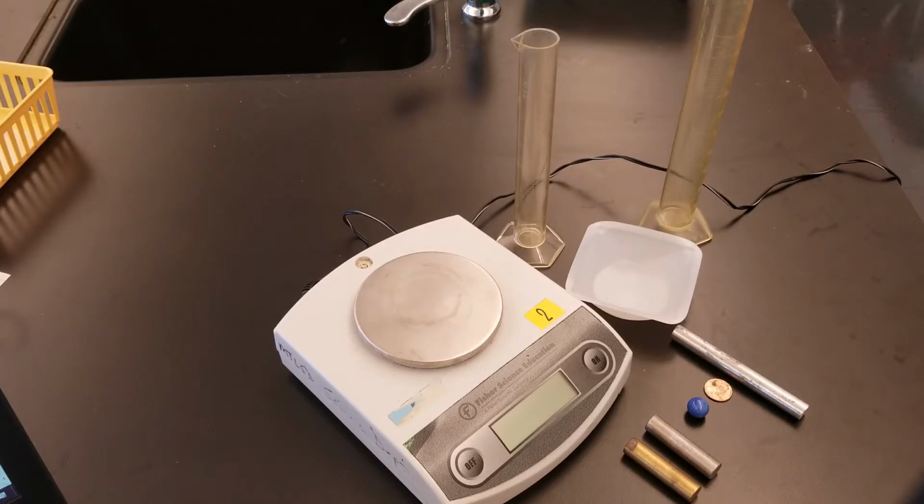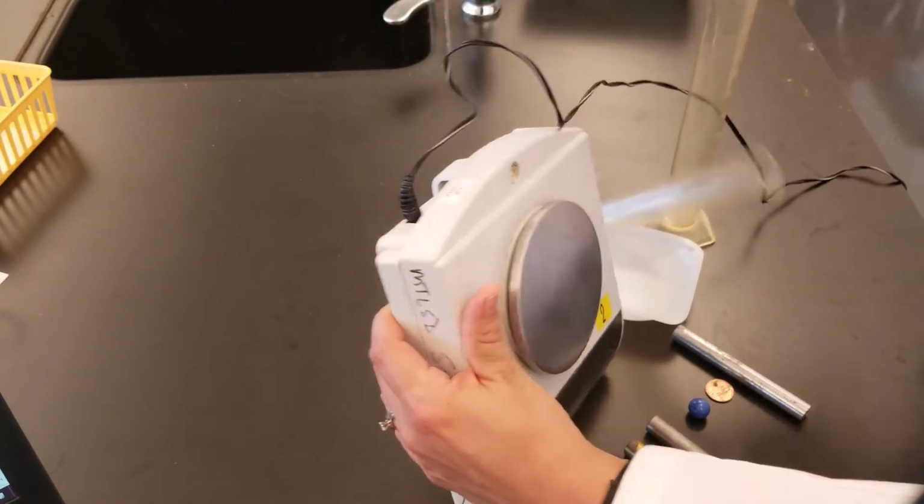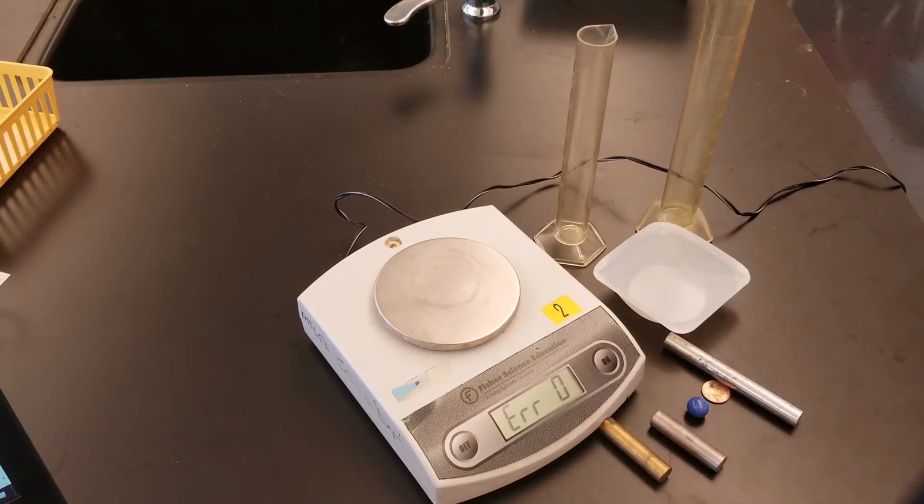In this lab, we're going to teach you how to use the mass of an object and the volume by displacement of water to determine the density of a substance. To turn on the balance, you first need to plug in to the back of the device. Wait until the display shows 0.00 grams.